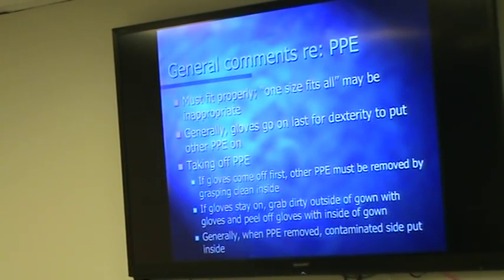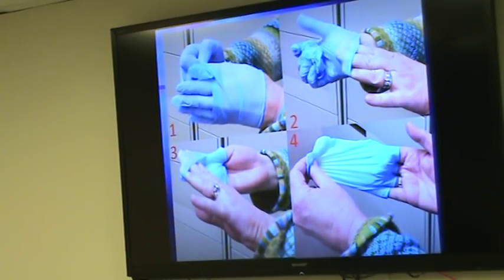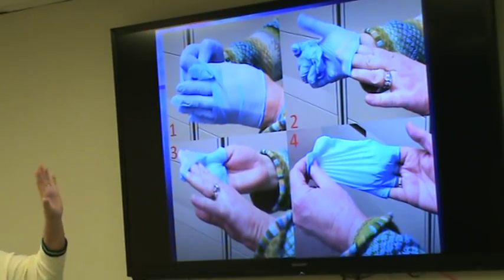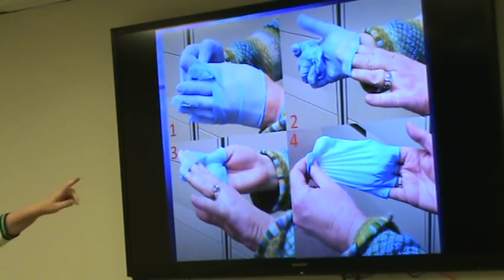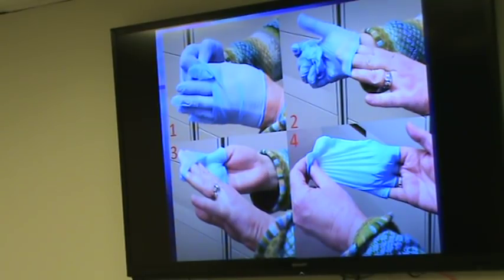And I'm going to run quickly through this because I understand that for most people in the Corps this is not an issue. But it is important to think about how you take off your PPE, including gloves. And one of the things that you need to do when taking gloves off is to make sure that you're not putting your nice clean hand on a dirty glove. So that idea, and everybody's seen this before probably, where you take the one glove off and crunch it in your hand, and then you slide your fingers underneath so that you're only clean to clean, flip it inside out, and so that's the proper way to take off gloves.